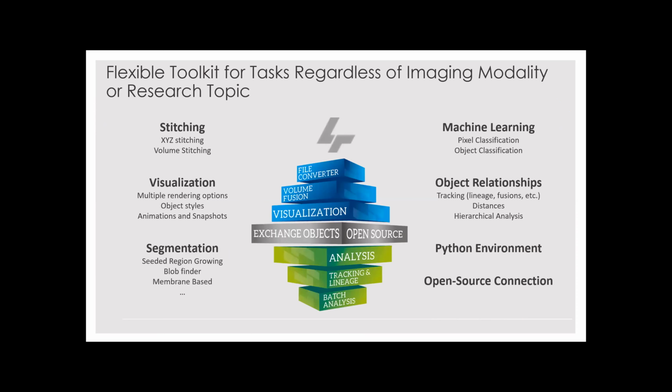Okay, so I'm going to highlight and give you a sense of a lot of different tools in Vision 4D. This is not an all-encompassing list. So if you have questions about a specific operator, tool, or algorithm, or anything related to your question, please pop it in the chat. I'm happy to address it. But to give you a general overview of the different topics or the different tools Vision 4D has, we're going to touch on some main ones.